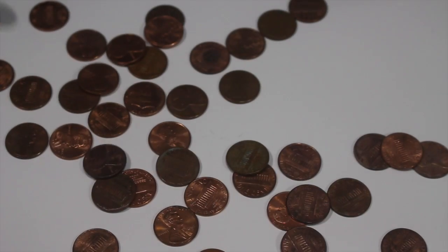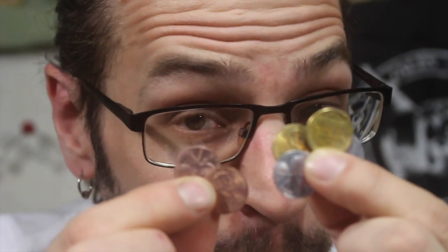Hey guys, what's happening? Today we're going to do some ancient medieval alchemy, but we're going to do it pirate style. So today we're going to turn some regular copper pennies into silver and gold.